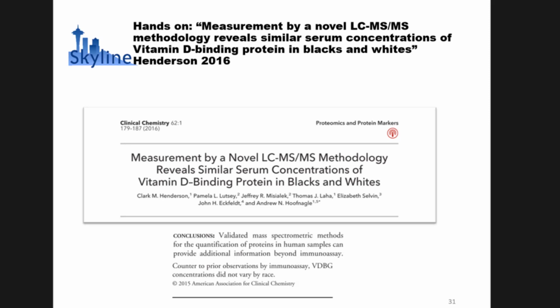I don't know if any additional things to say. Yeah, for the variability, do you guys do anything additional? I don't think so. For LC variability, yeah, I think internal standards are pretty much it.